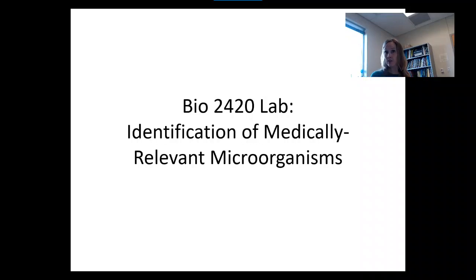Welcome to an overview video for the theory, the structure of the lab. We will spend about 85% of this semester working on bacteria, how to grow them, how to identify them, with the same kind of structure that one would use if you worked in a clinical lab. So you get a sample from a patient and your job is to identify what it is that's making that patient sick. We'll spend the end of this semester doing a project with protists and fungi and worms.